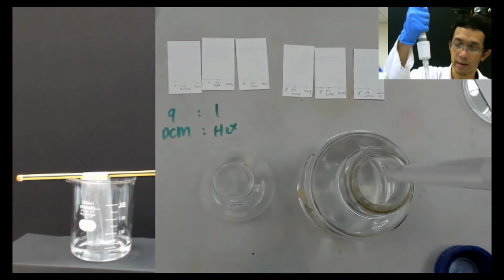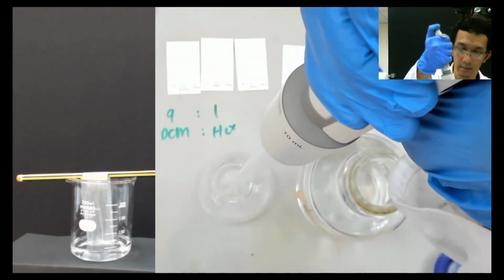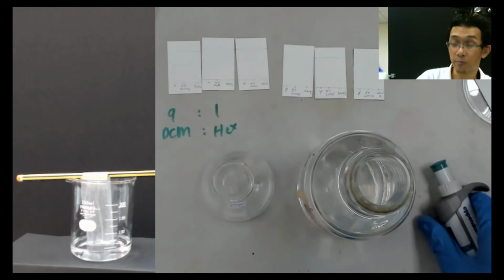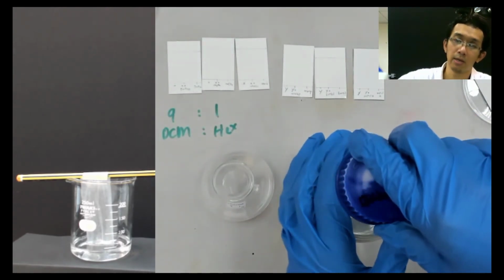Okay, so I have this, and I will put inside this. Okay, so we done that, and then we put our tip, hit that. It's important when you do any lab, you need to be relaxed.